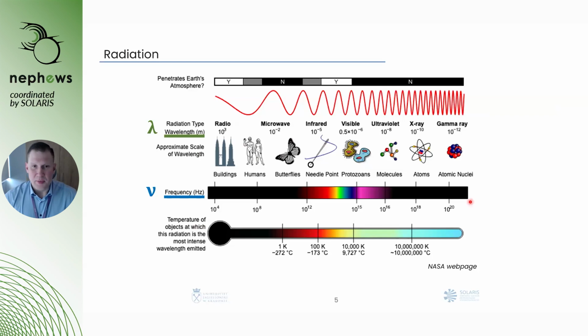As we speak about light, about electromagnetic radiation, and about synchrotron light or synchrotron radiation, we know that electromagnetic radiation exists in a big range of wavelengths or frequencies, and wavelengths and frequencies connect with the energy of the photons or the energy of electromagnetic radiation by the equations presented here.